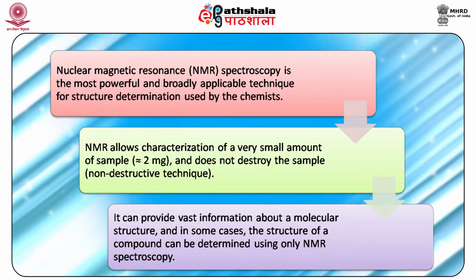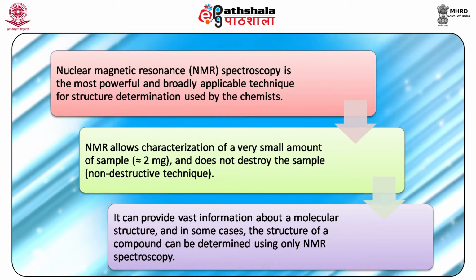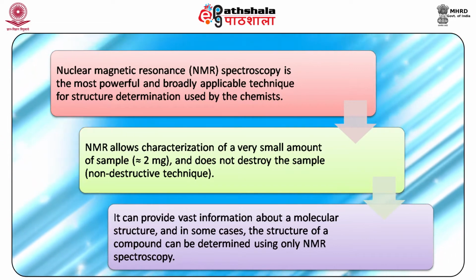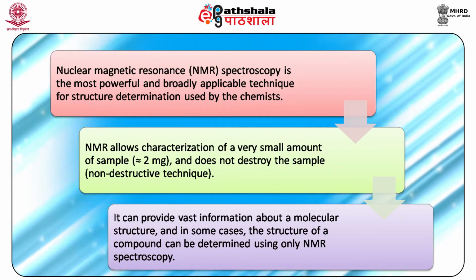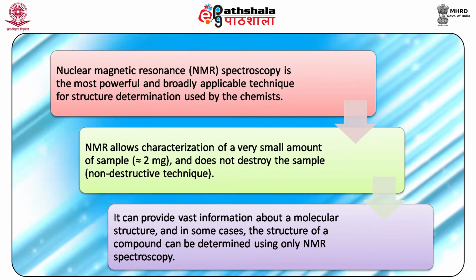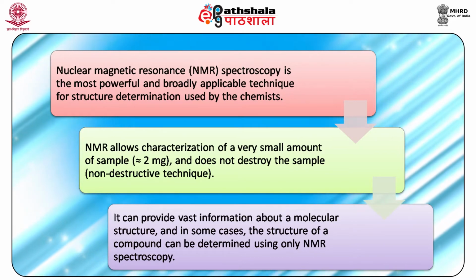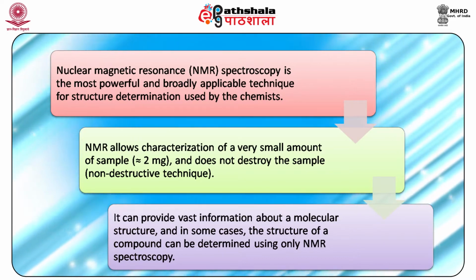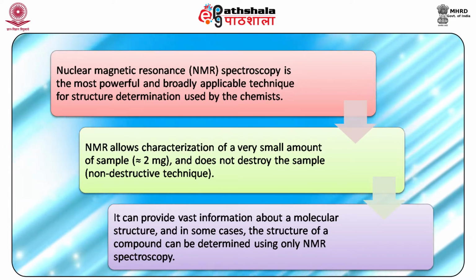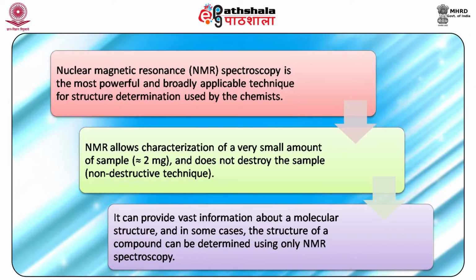NMR allows characterization of a very small amount of sample, that is close to 2 milligrams, and does not destroy the sample, that is, it is a non-destructive technique. It can provide vast information about the molecular structure of an unknown compound, and in some cases the structure of a compound can also be determined using only NMR spectroscopy.